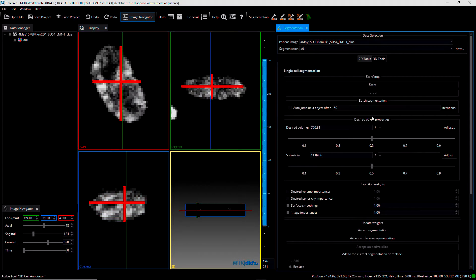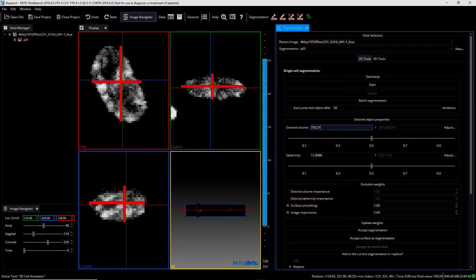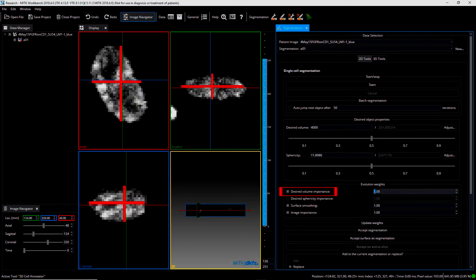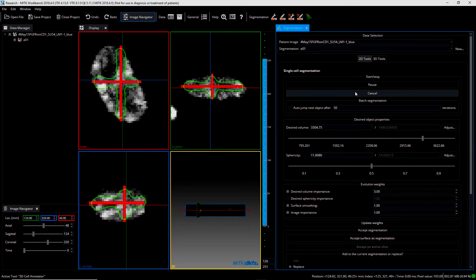Now that we have some rough initial contours, we can start using 3D Cell Annotator to obtain a precise segmentation. 3D Cell Annotator provides several parameters helping you to adjust the contour in real time during surface evolution. The two most important are the desired volume and the desired sphericity. To enable the manual adjustment of these parameters, just click on the flag buttons at the bottom part of the graphical user interface.